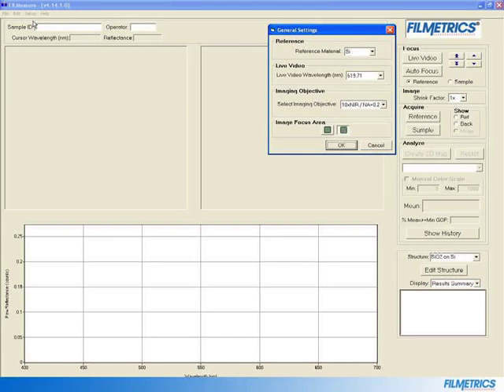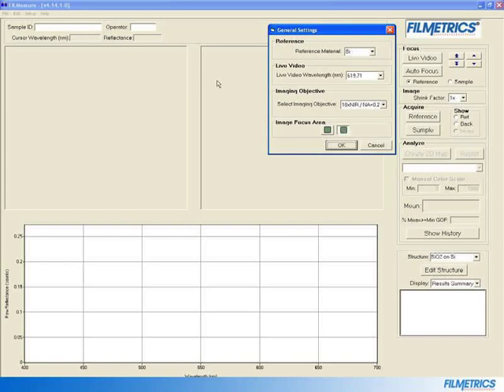Make sure that under Imaging Objective, the selected objective matches the one installed on your system. For our example, we are using a 10x NIR objective. Also verify that silicon, or Si, is selected as a reference material. Then click OK.